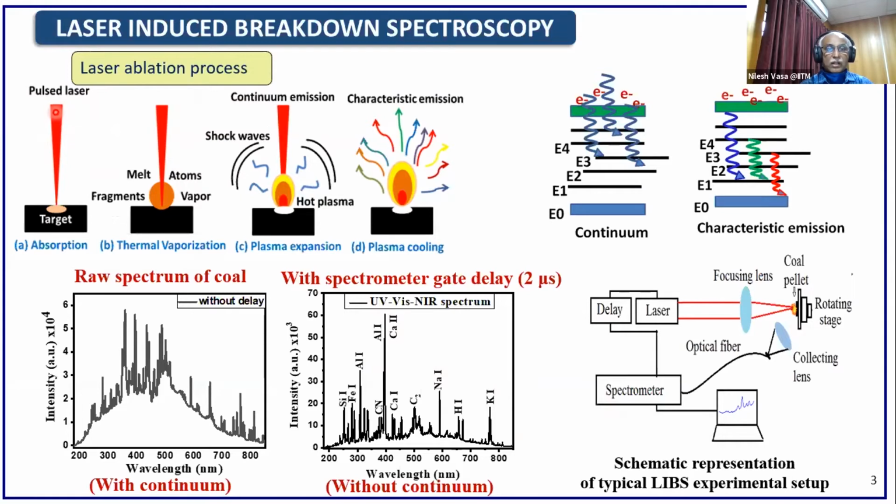However, traditionally a nanosecond pulsed laser is used, and the laser beam is used to heat the material, and correspondingly the temperature increases, and of course thermionic emissions, electron emissions, etc. improve the absorption of this laser further.